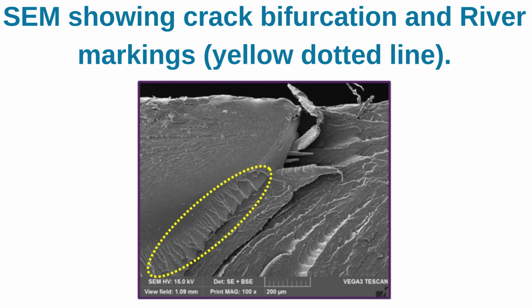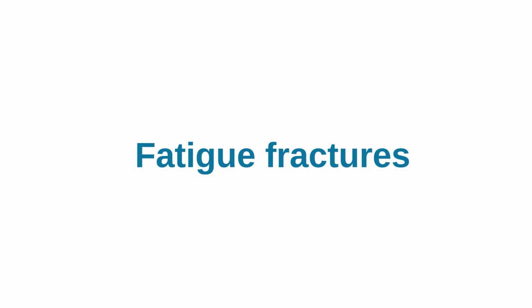Brittle fractures appear differently depending on the degree of stress concentration. These changes can also be used to identify the cause of fractures. River patterns, named because they resemble a flowing river, are caused by crack propagation. They are characterized by spreading radially from the crack area, so you can identify the crack area by searching for the region at which they converge.